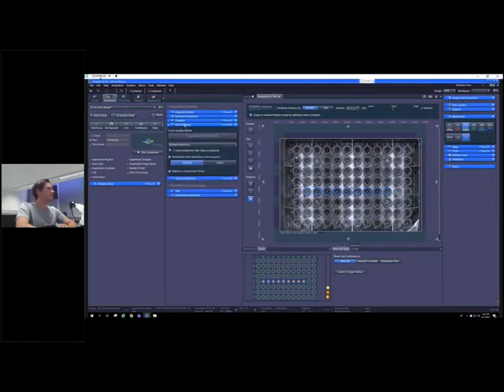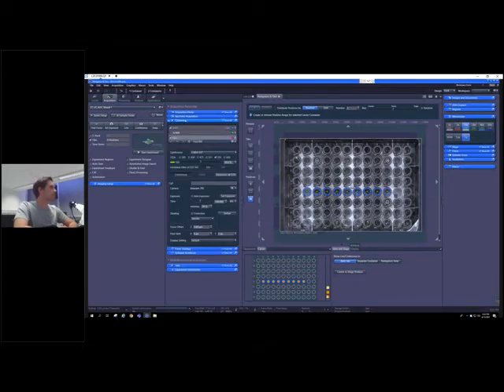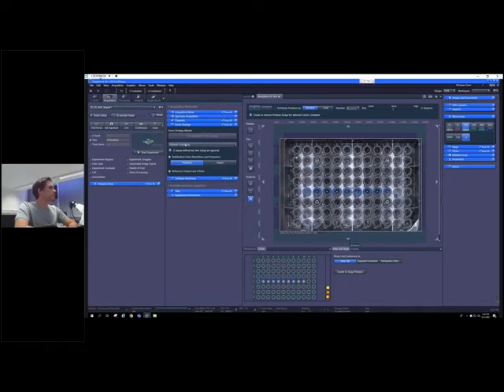And last but not least, we want a focus strategy. Again, we want to make use of the autofocus. By the way, and this would make a lot of sense, for example, in a time series experiment, you can also use a hardware-based focusing strategy, using our reflection-based Definite Focus tool to run a very quick focus stabilization, for example, to keep the relative focus constant over time. All right, so that's the experiment we want to execute now.